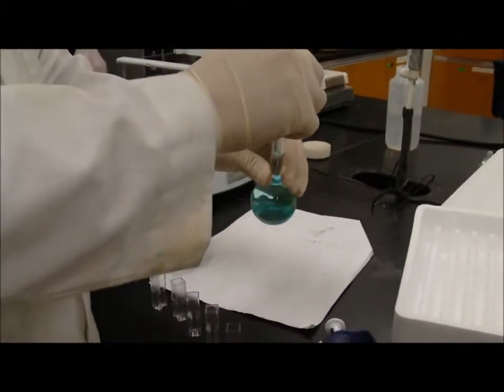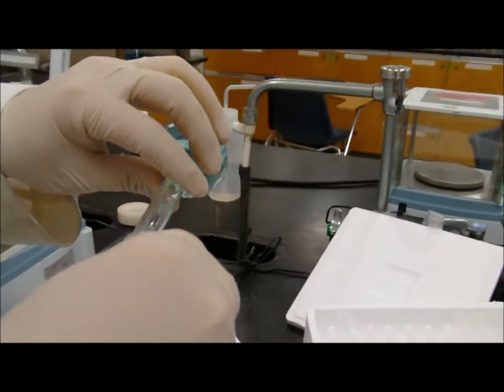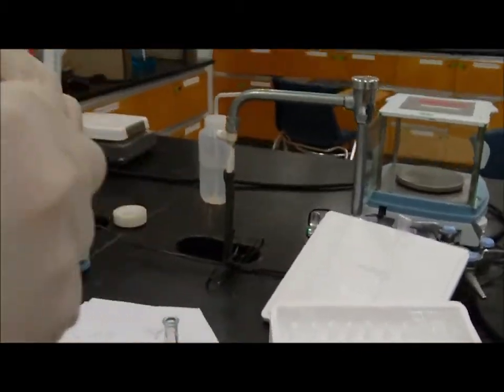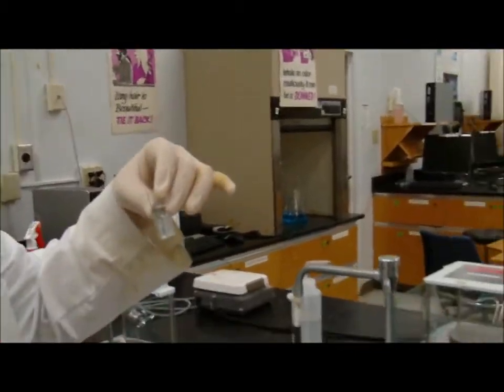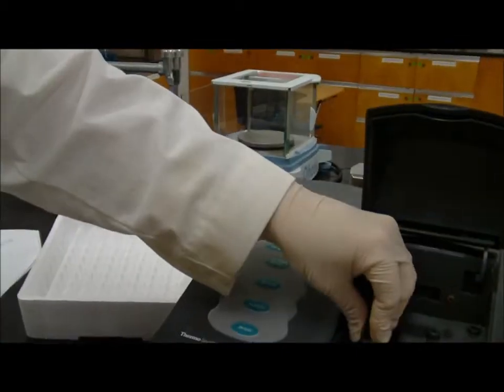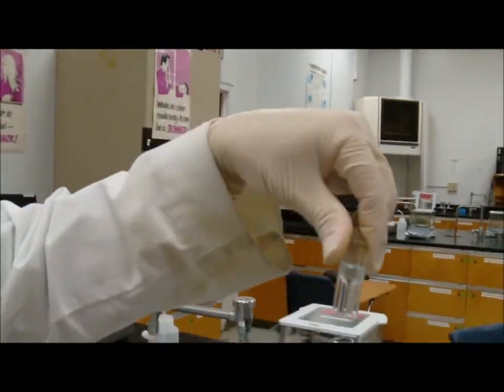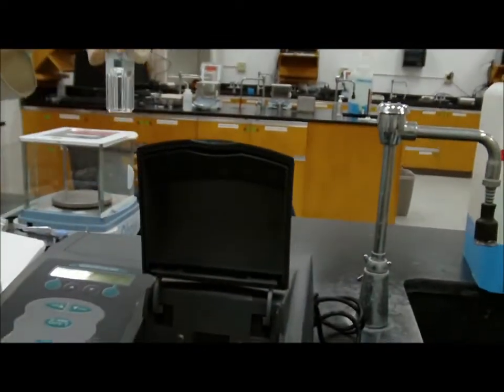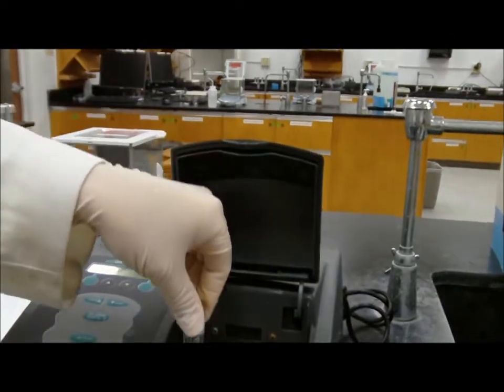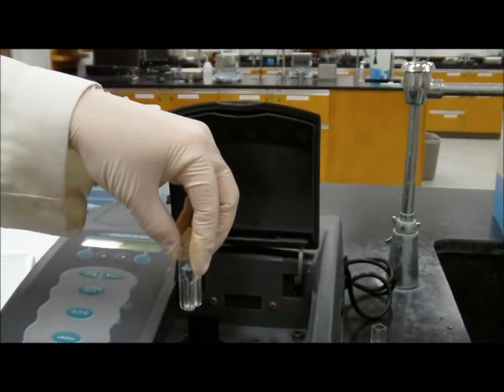First of all, I'll take some of this 0.05 molar and put it in the spectrophotometer and see if the absorbance reading is below 1.3. Make sure I have no smudges on the windows. Make sure that it goes in this direction, not this direction. It doesn't matter if I have it completely turned around, but it has to go that direction.